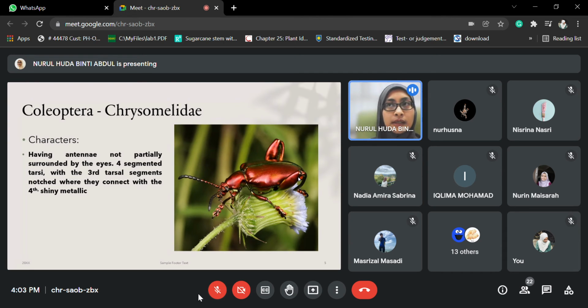But if you are talking about yang chrysomelic yang kita tengok tadi, first we have Aulacophora. Remember Aulacophora flavomarginata, melon beetles tu tadi, dengan Fovecolis. That one also chrysomelic. So you imagine dia punya shape is totally different, tak sama macam this guy. Okay, yang tadi tu tak ada pun enlarged femurs, hind femurs.